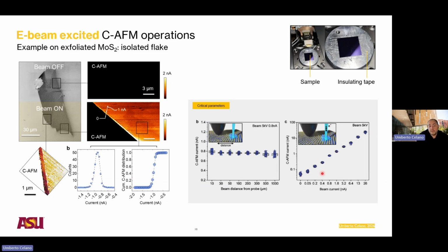We will go back to that in a second, but this is a very interesting knob because, to some extent, and you will see, it breaks us free from some of the existing current limitations when applying a certain bias between tip and sample, because generally you are limited by the amount of volts that your generator can apply, while here, effectively, you are limited by the amount of current that you can pump into the system. And in an SEM, the range is fairly large.